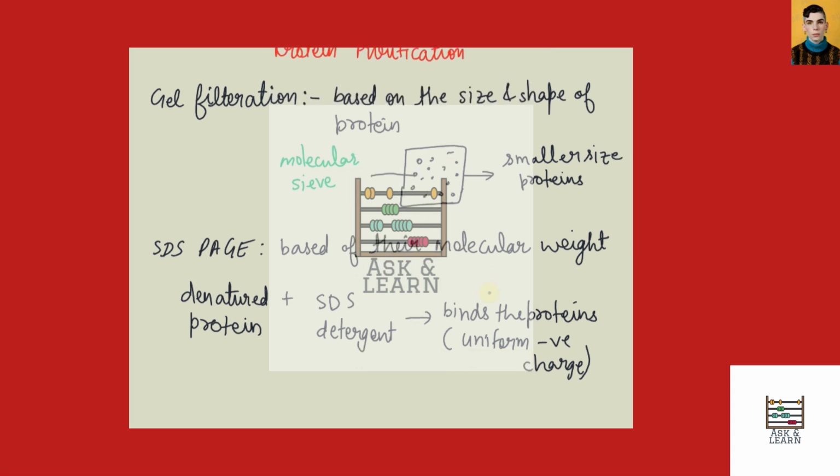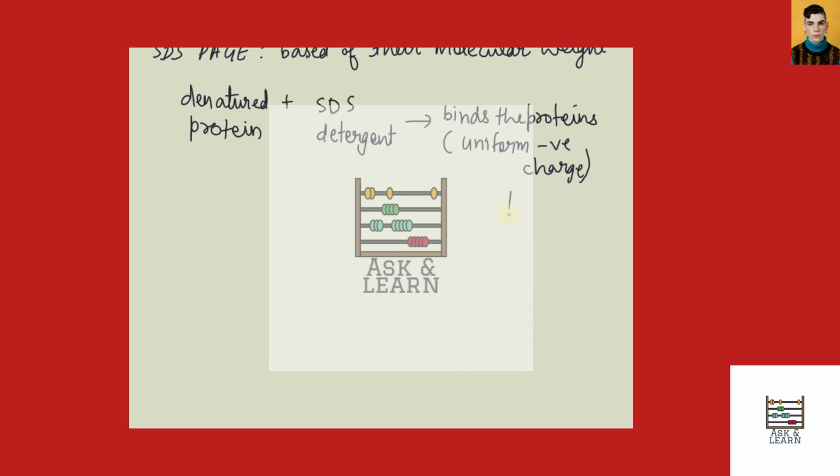Then the proteins that are bound are loaded on a gel. Now that gel is made up of a polymer that is polyacrylamide.